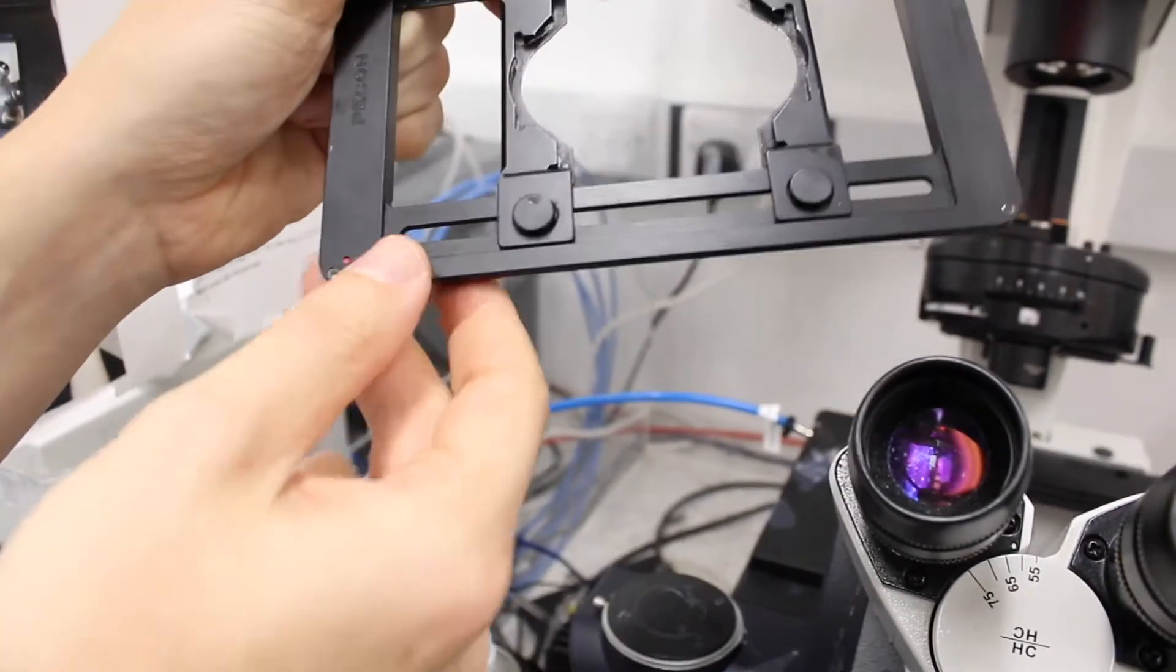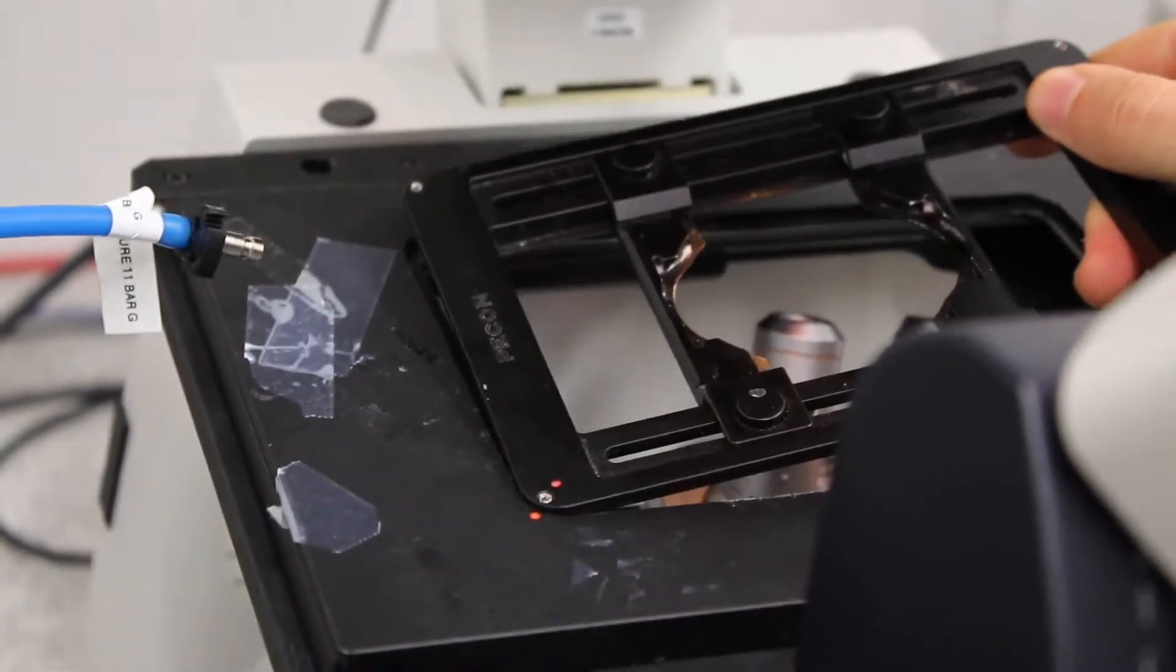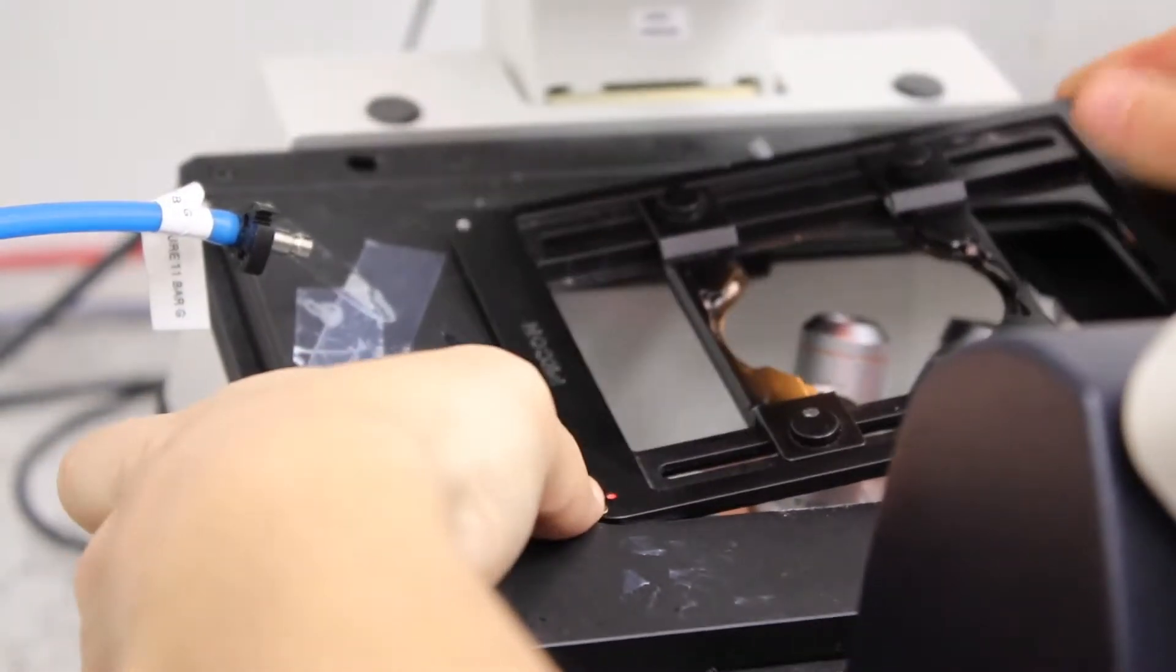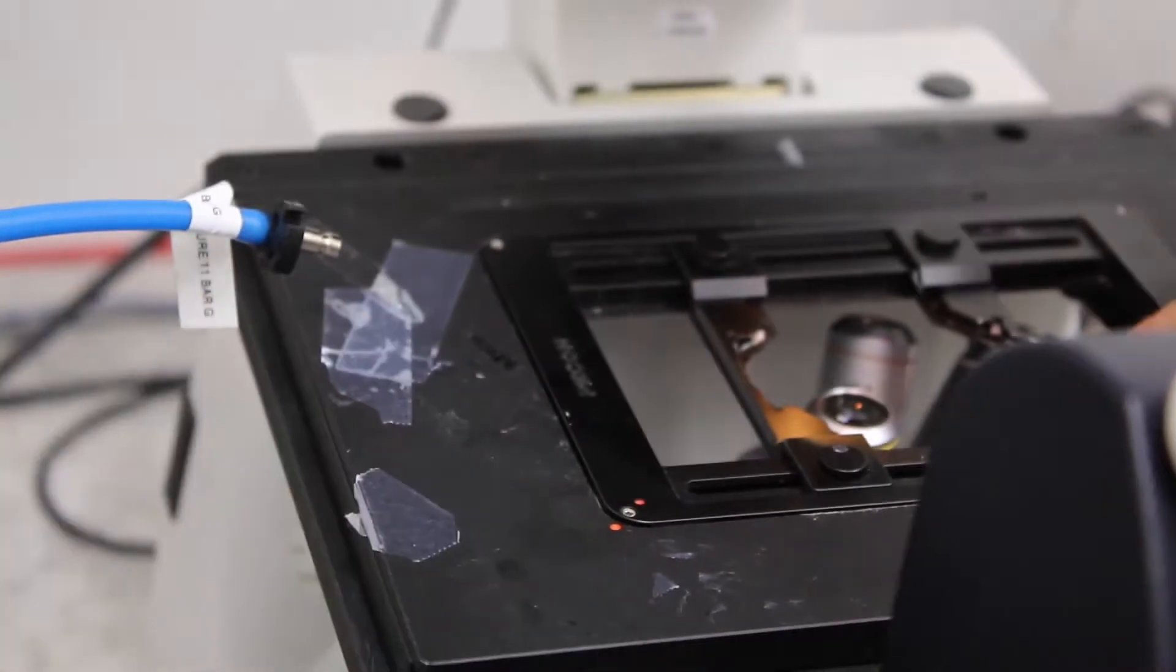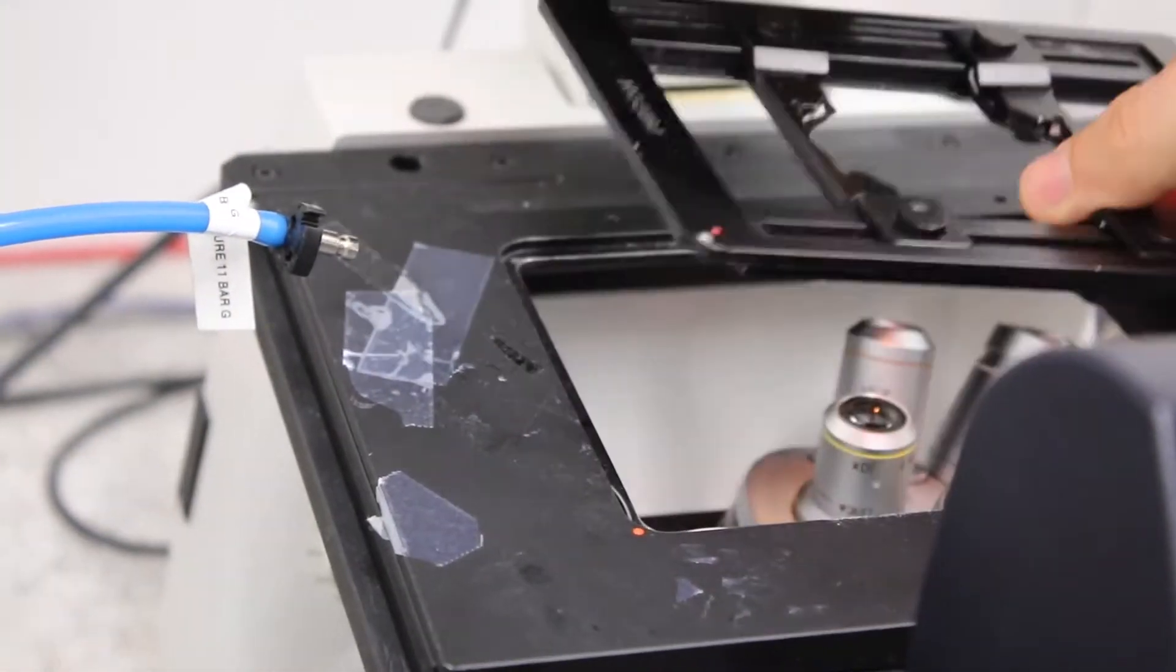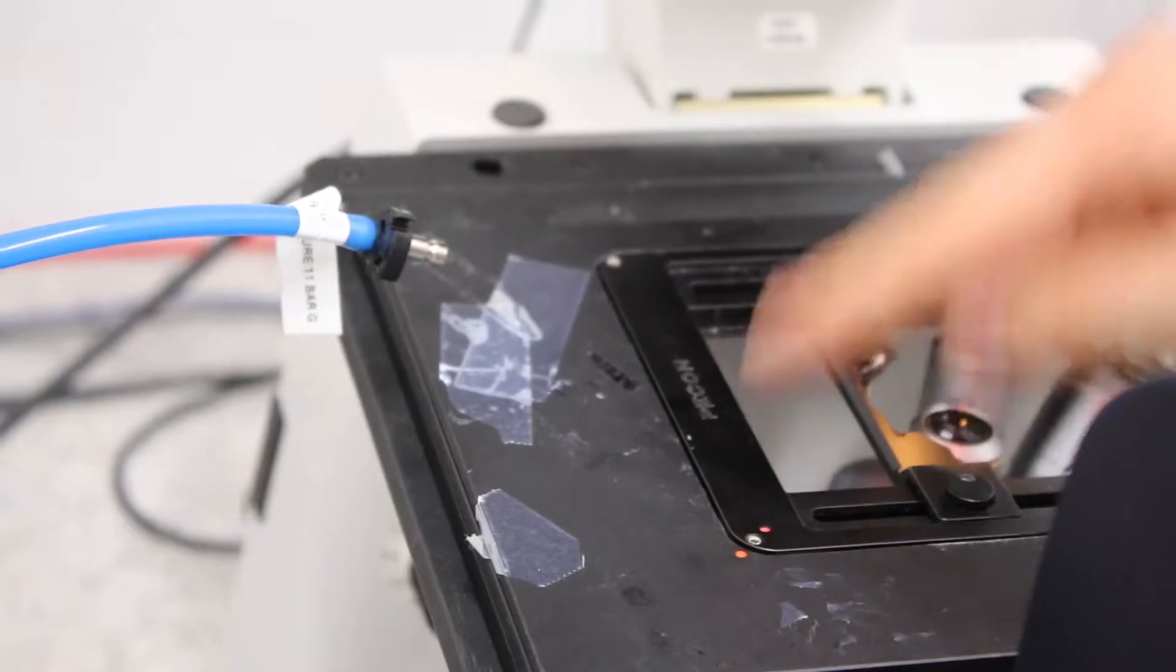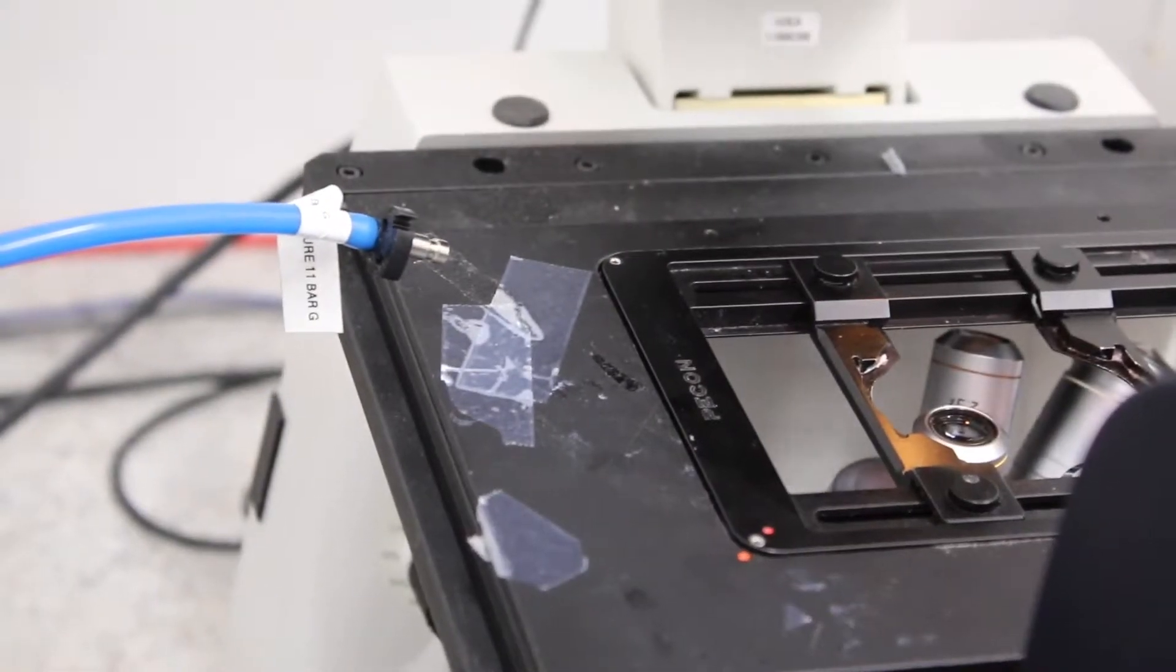So then you can block the sample holder. If you're just putting it like this, it will move. So you need to block it, and then it's blocked, it's flat, it's not moving anymore.